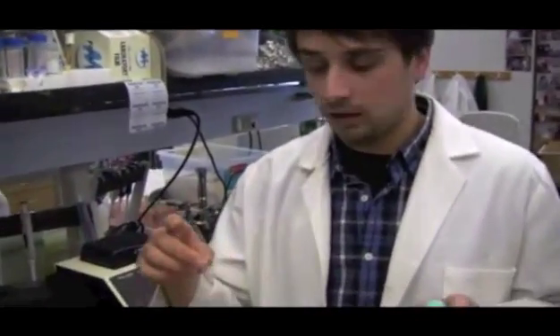So this has everything we want on it. It has the DNA that tells the cell how to make our protein and how to put one of those glowing molecules onto our protein. So now all we need to do is get it back in the cell. You can't exactly just take some tweezers and stick it back in there. It doesn't quite work like that. So we need to figure out a way to do this. There's a convenient way that biologists have figured out how to do this in plants. We're going to use bacteria.